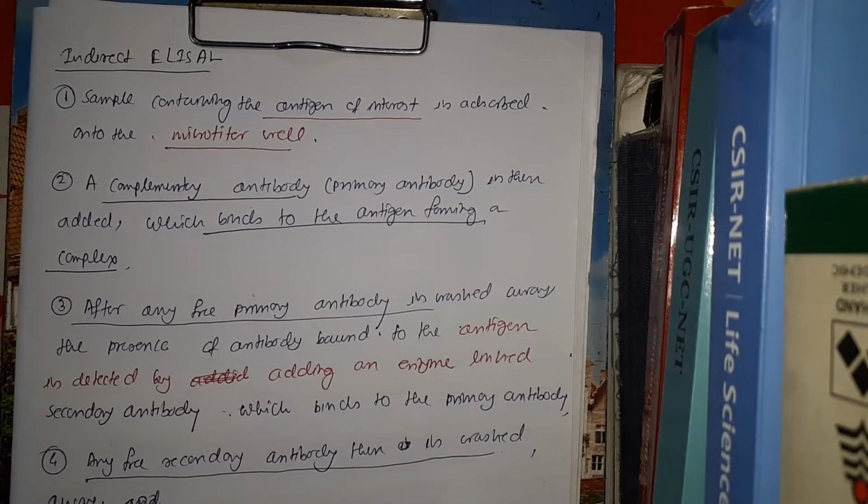In this video lecture we are going to continue our discussion regarding ELISA. In our previous video we talked about direct ELISA. So in this video we are going to talk about indirect ELISA. Indirect ELISA is simply a modification of direct ELISA.